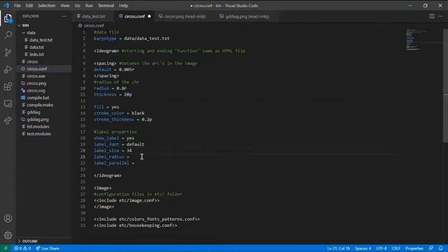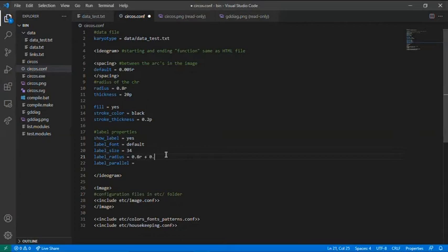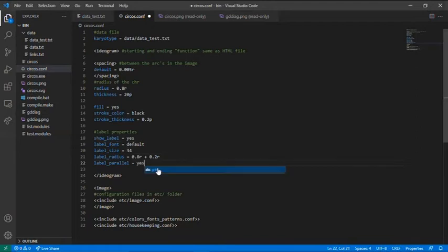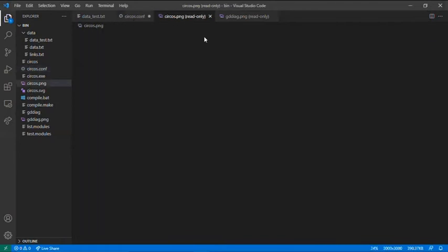The label radius, it needs to be a bit more than the image. So, 0.8, the same as the radius, plus 0.2r. If you want to label parallel to the circle, just press yes, as I have here.